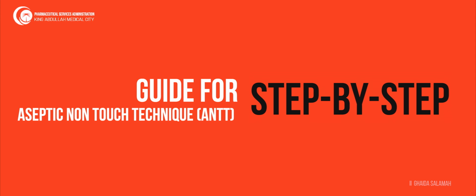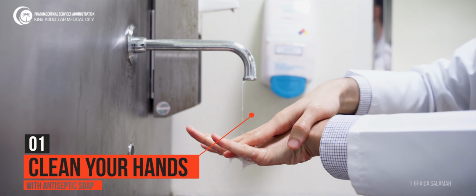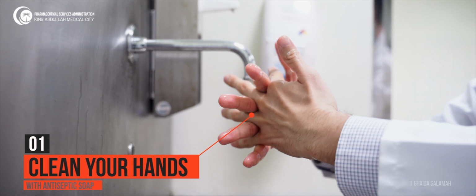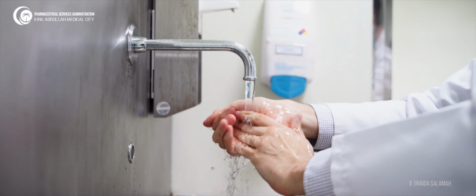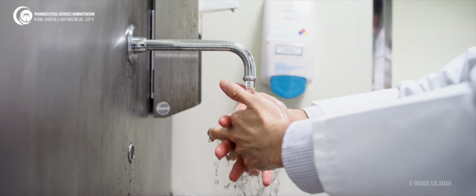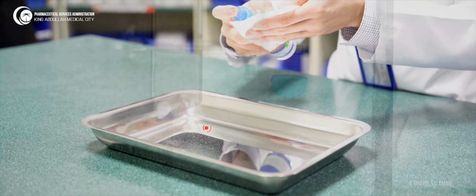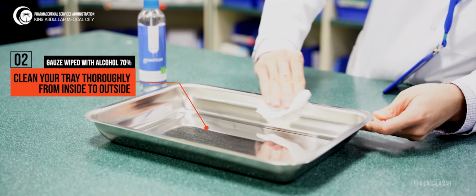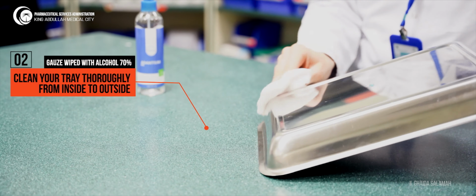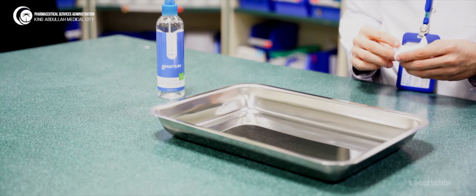Let's talk about the step-by-step guide for aseptic non-touch technique. First step, you should clean your hands using antiseptic soap. Cleaning hands usually takes from 45 to 60 seconds. After you finish hand washing, you will clean the tray from inside to outside using a gauze wiped with alcohol 70%. As you see, the cleaning should be from the inside first, then the outside part. After this, leave the tray and allow the alcohol to dry.